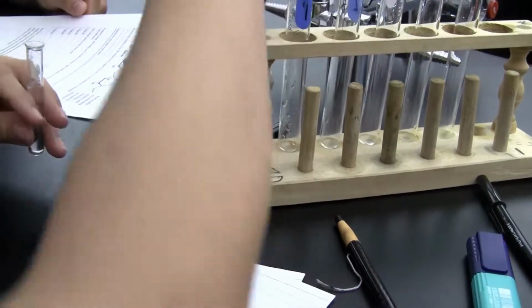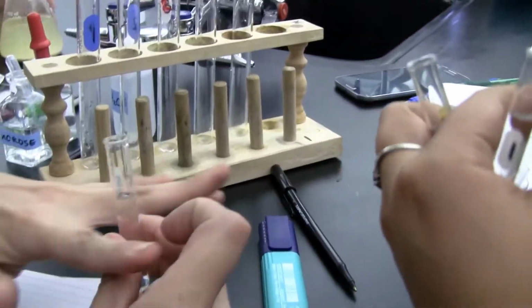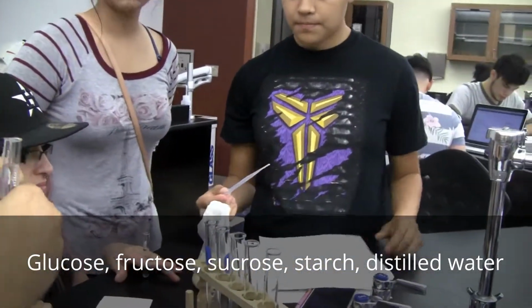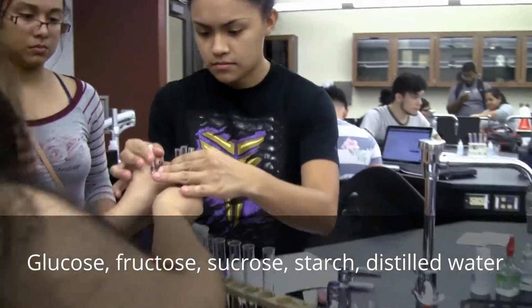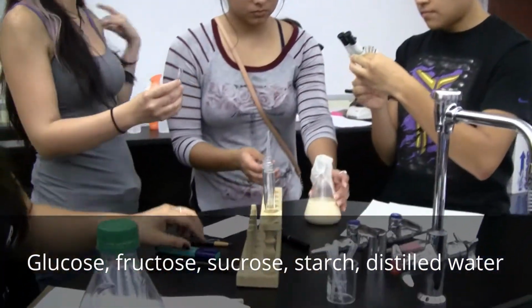Yeah, that's cool. Now we're putting yeast to the very top of all of them. You want to do this part? Freshly prepared yeast to the 5 tubes, to the top. You hold them, and then you can do the flip part. Do them in order. That's number 1.